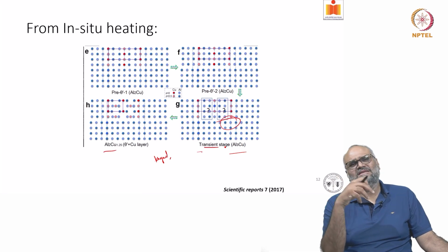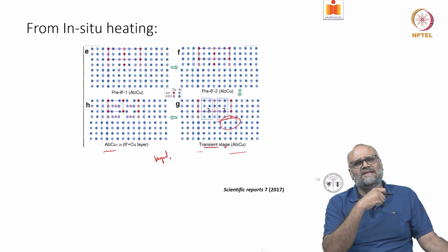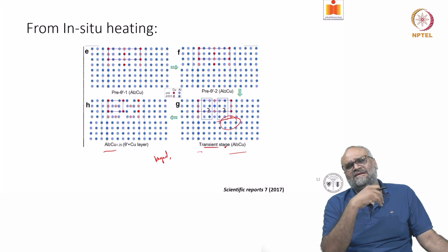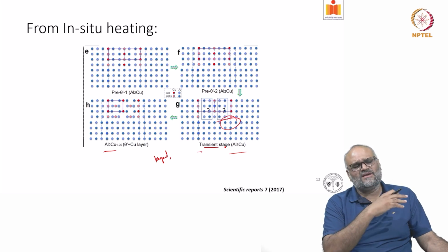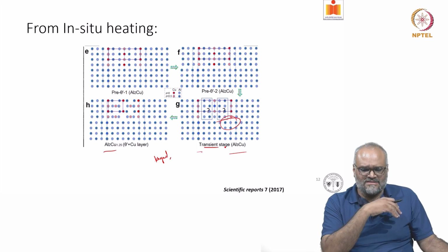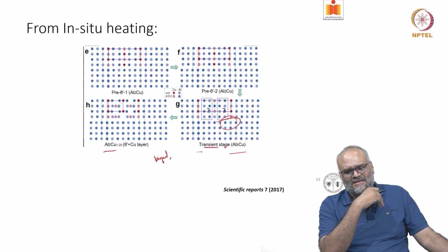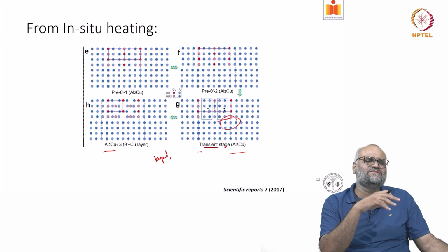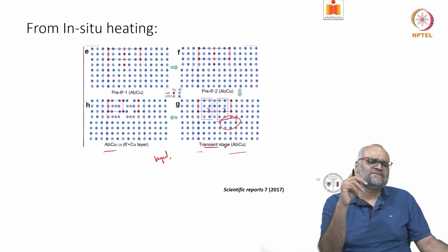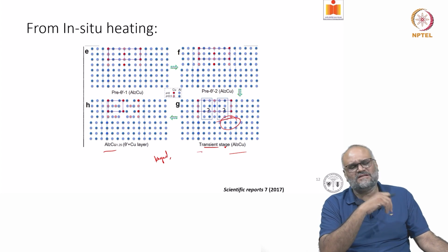So by looking at these kind of processes in real time in transmission electron microscope, you get an idea on the crystallography of the system that you are looking at while the changes are happening in real time in the microscope. So you're already going one step beyond what can be done in conventional TEM. So this is one of the initial studies where at high resolution we were able to successfully look at a link between different stages of precipitation on the same specimen from the same location. And this gives you a lot of valuable insights into the material properties.